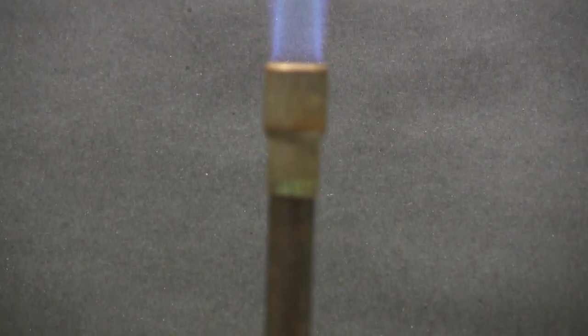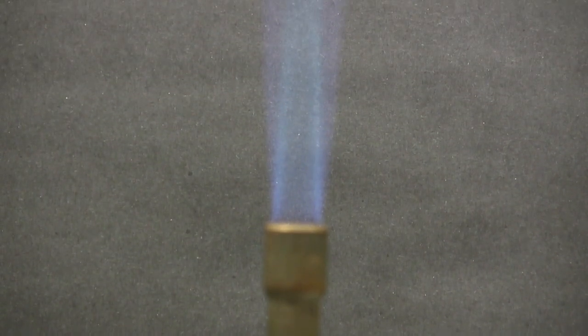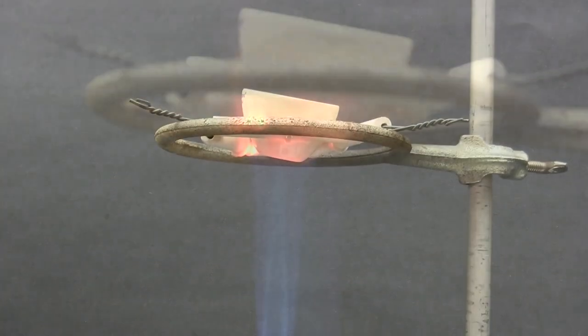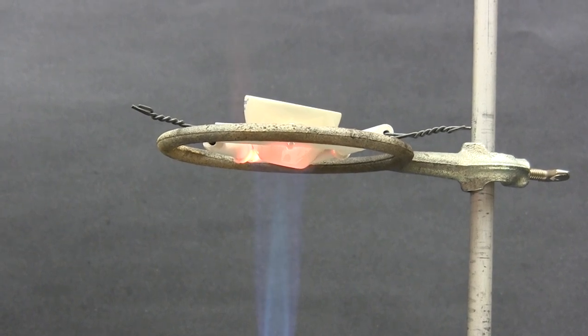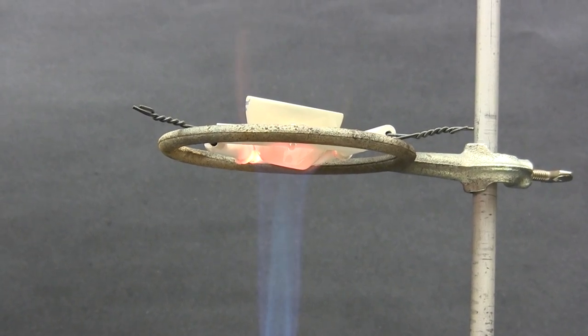And here we see a porcelain crucible being heated in the Bunsen flame. Again note how we place the item to be heated at the tip of the inner blue cone, the hottest part of the flame, and see how the underside of the crucible is red hot, indicating that it's being heated properly.